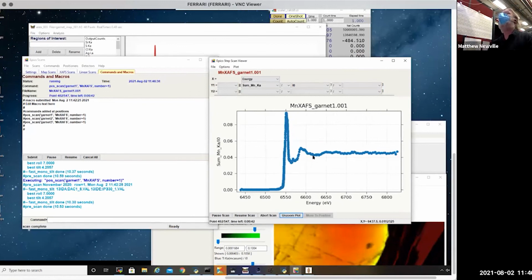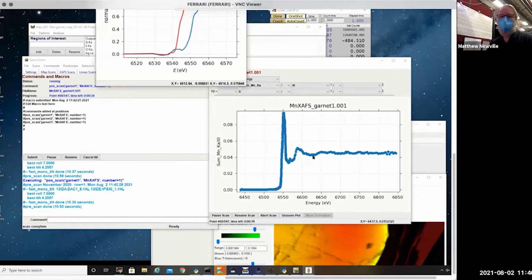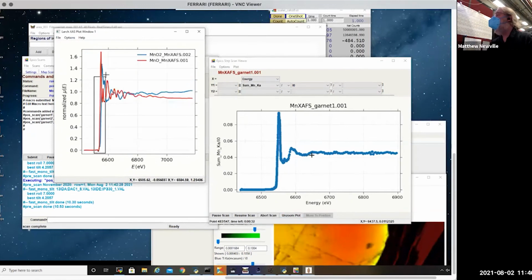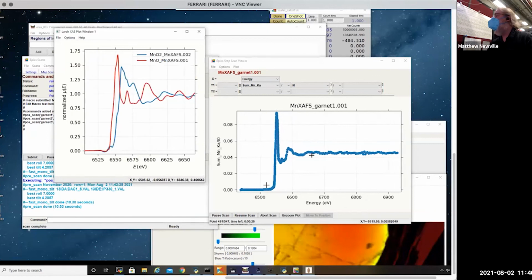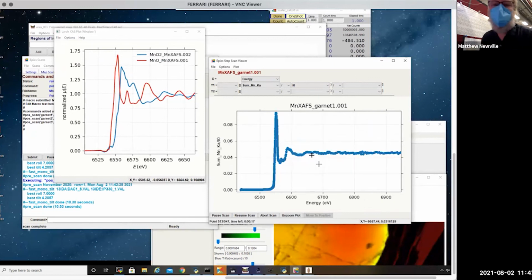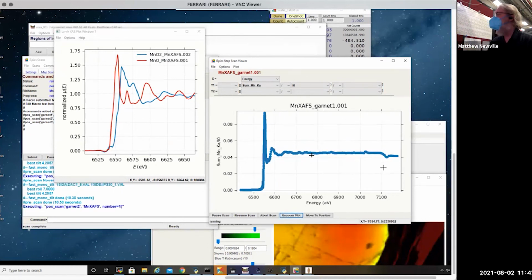Let me read that in with the XAS viewer, so bring an XAS viewer over here. That's our 2+ and 4+. And you can see it's even got a little bit of this thing right at 70. So this is going to finish. We're only doing one scan. For fluorescence, we might want to do multiple scans at a time. This is just going to go on to the second point that we saved and then go do that one. It's probably overkill to go out to k of 13 inverse angstroms on this, but we're just doing it. In fact, we ran out to 13 inverse angstroms, and there we see this little thing there, which is almost fascinating.